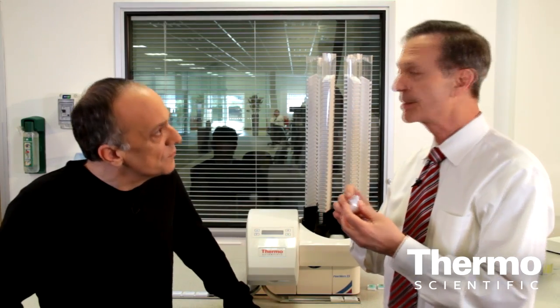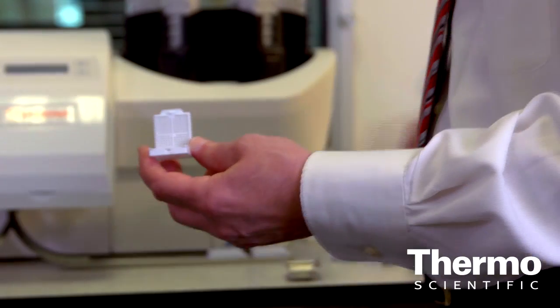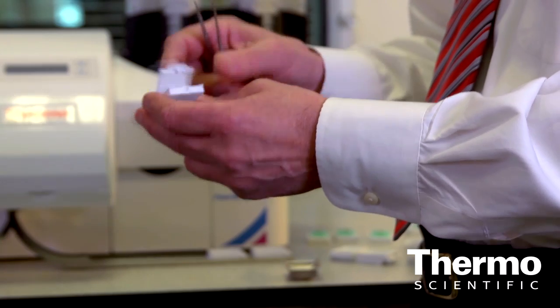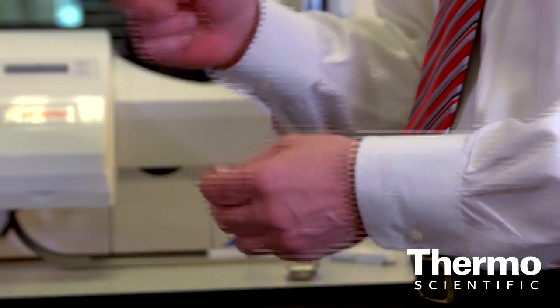In a traditional way that histology works, this is a tissue cassette. Tissue is taken out of a patient, sent to the laboratory. Pathologist then cuts a small piece off of what he wants to see under the microscope, puts it in the cassette, snaps it shut, goes through tissue processing. That's a series of reagents that actually take the water out and replace it with paraffin wax.